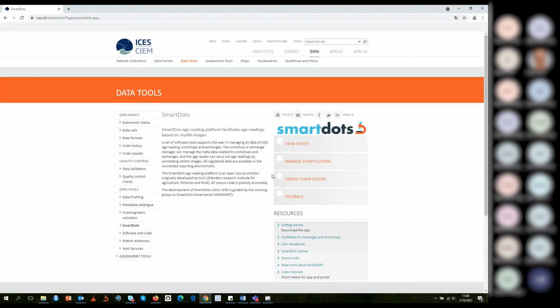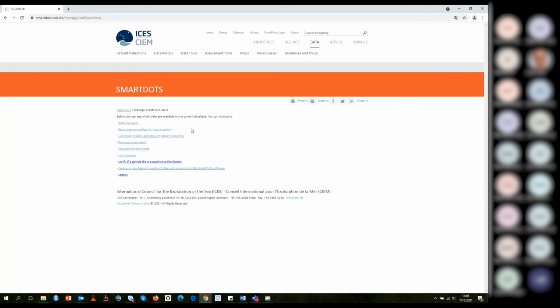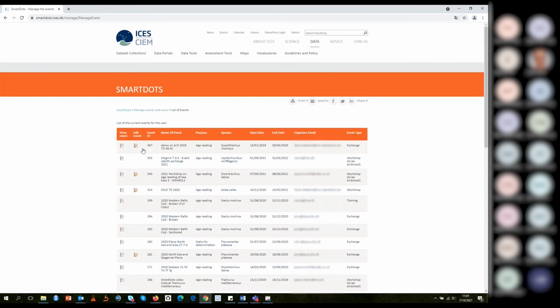Okay, so that's fine. I will continue this demo with how you should report all the results. So again, this you have seen already. You go to manage events, check, and then you go here in the list to manage current events, where Julie was before. And we made the demo event on Brill 2019, where all the samples are already annotated.